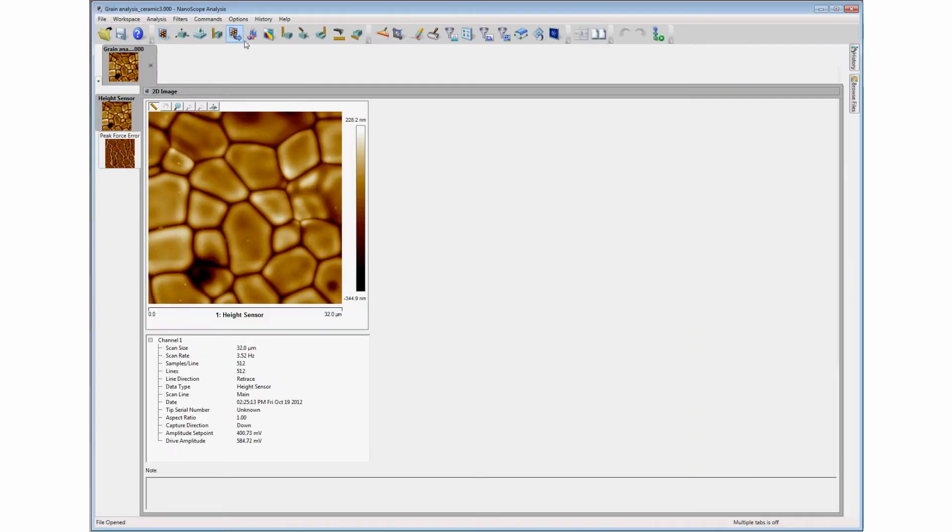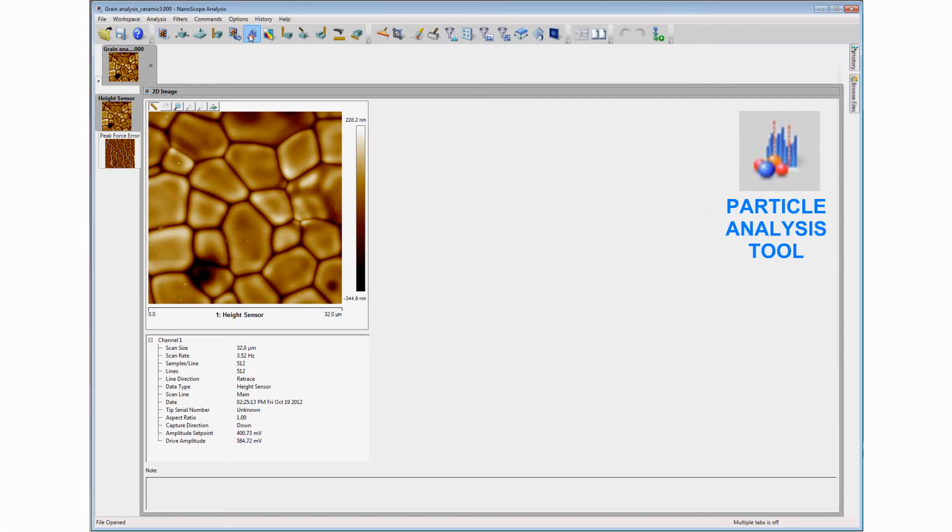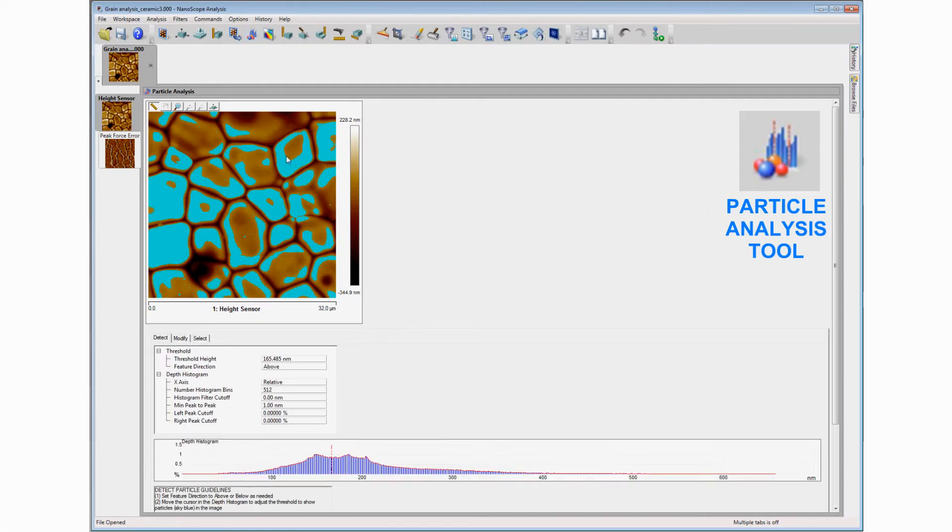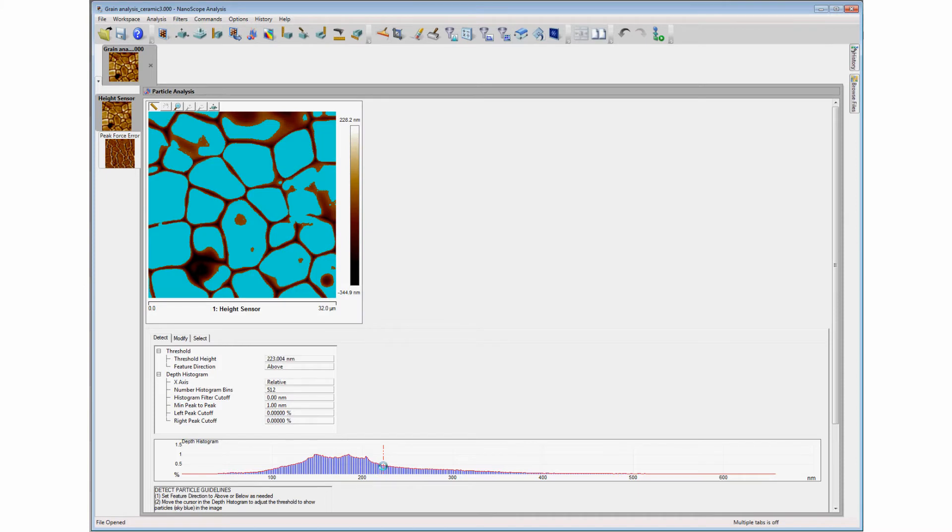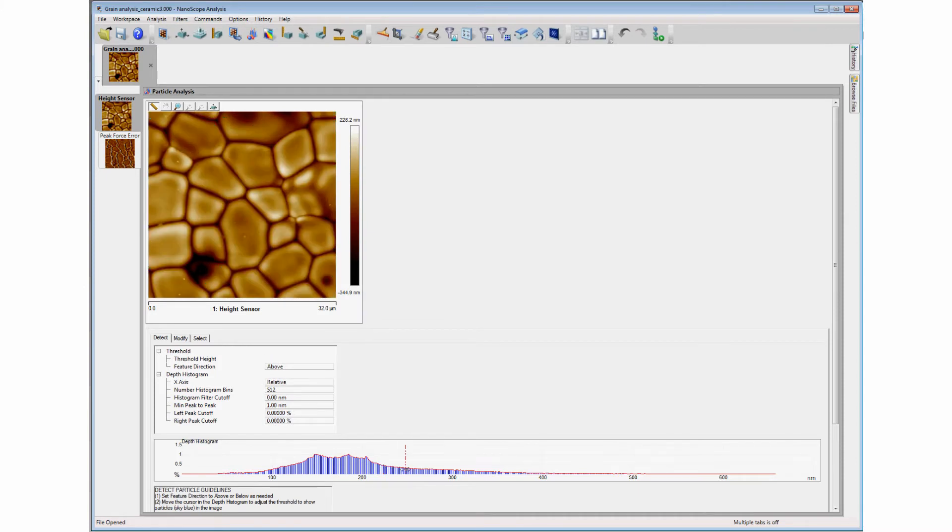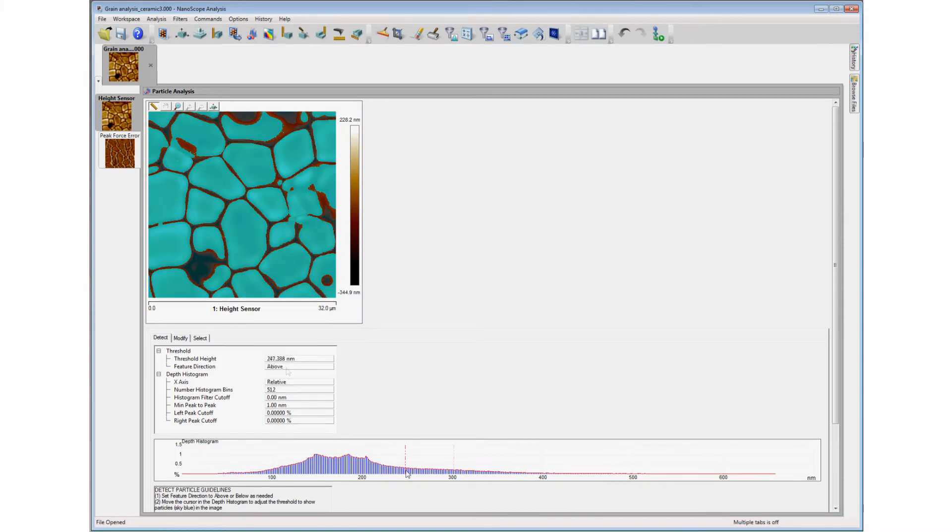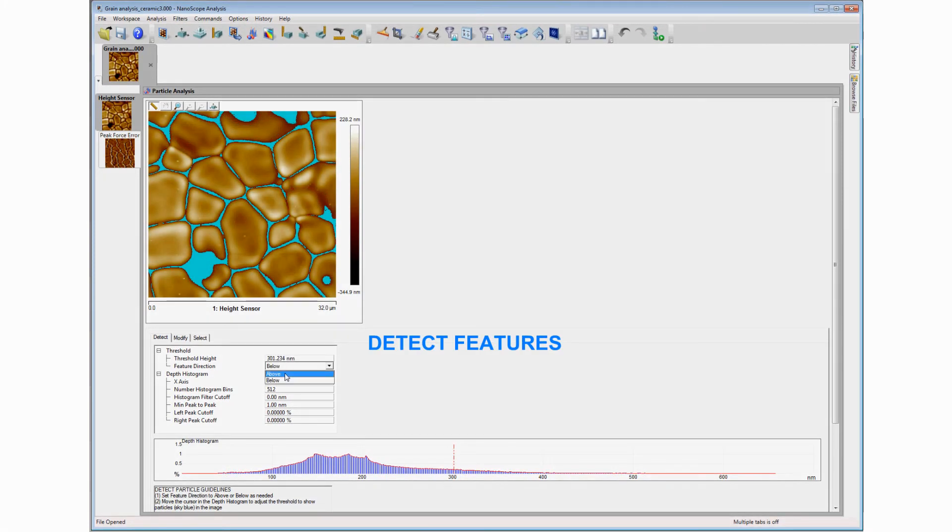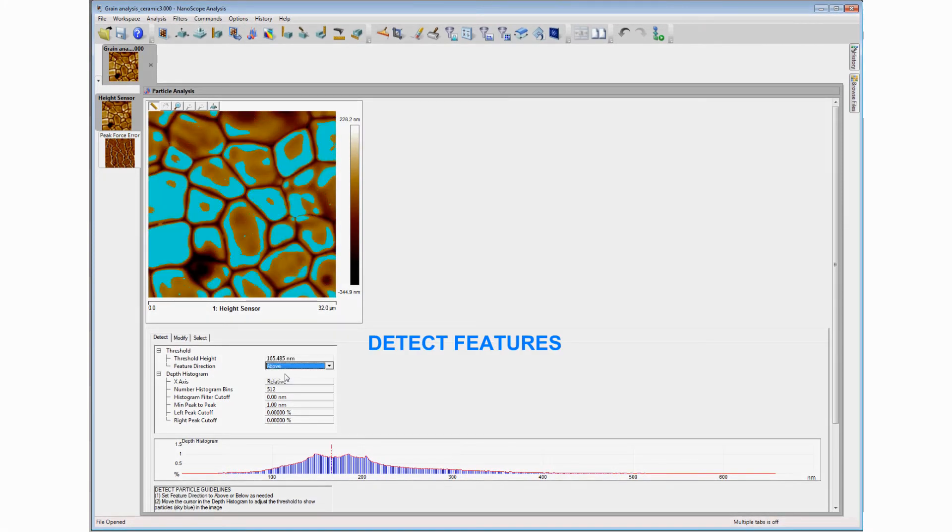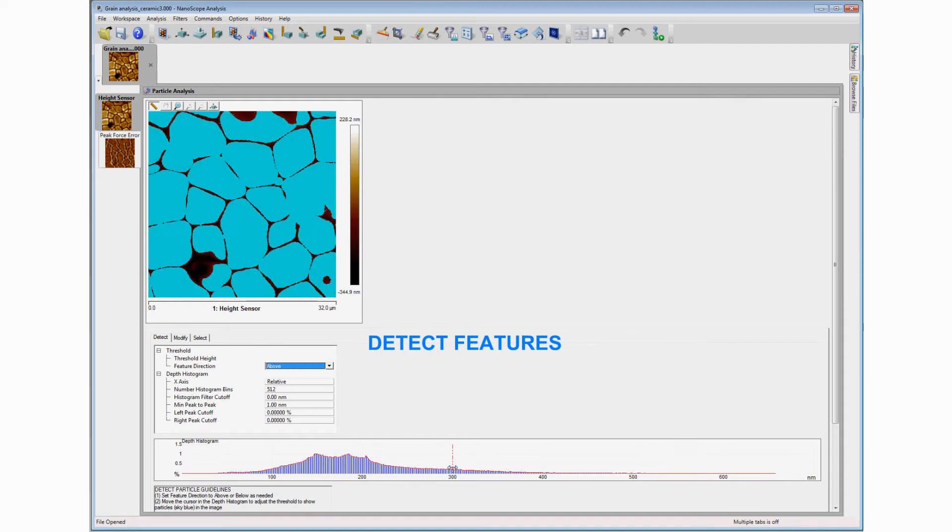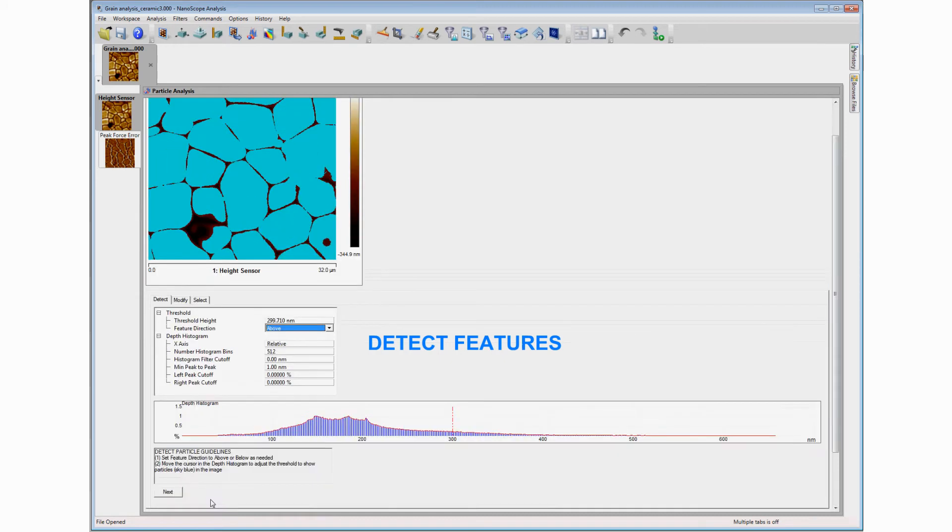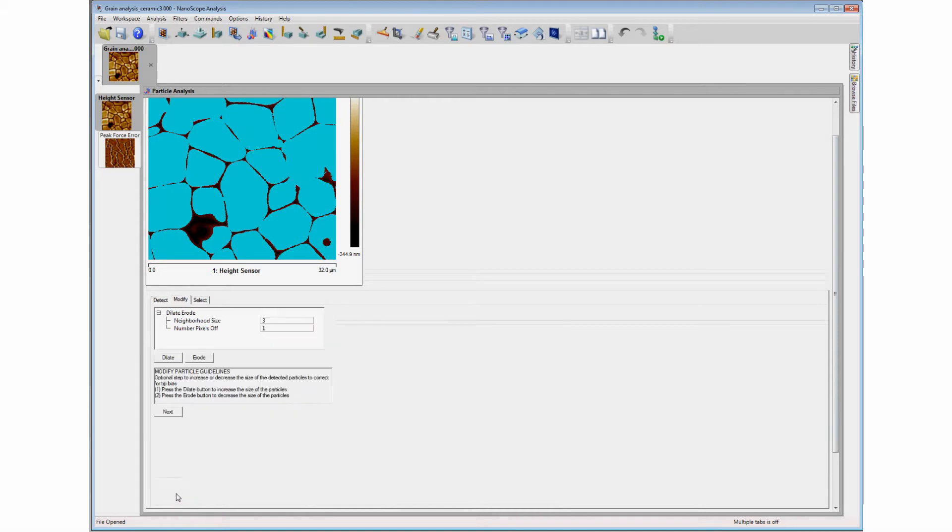Images that have distinct boundaries between regions or structures can be subjected to statistical processing via the particle analysis command. The user can select features above or below a point in the depth histogram and move the cursor to select the threshold limit that defines the features of interest.